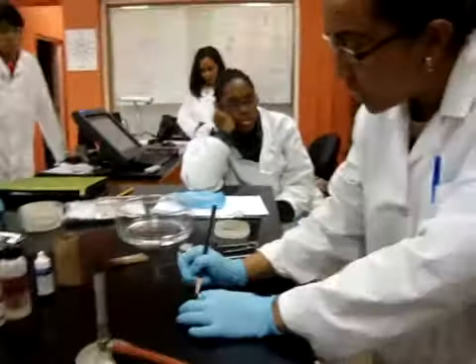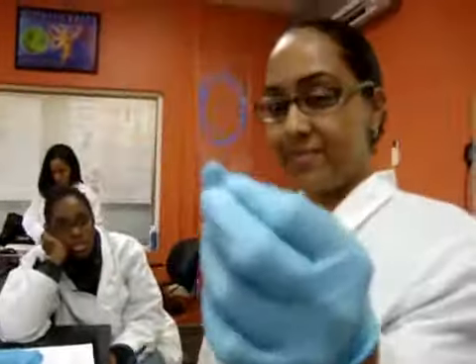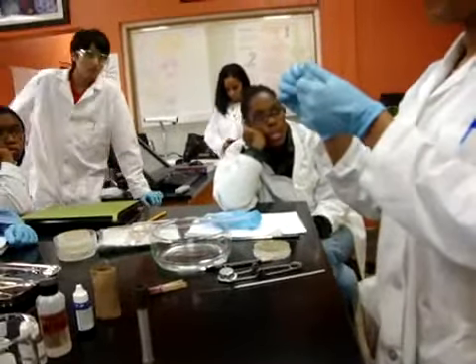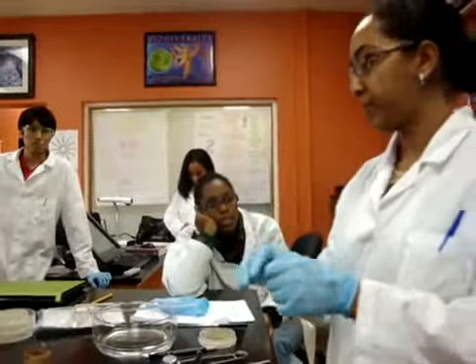And then on the other side, I'm going to draw a nice big circle. This is going to be my target for where I want to make my smear. Now, I drew the circle on one side, but I'm actually going to put my smear on the other side. The circle is just a visual target for you.